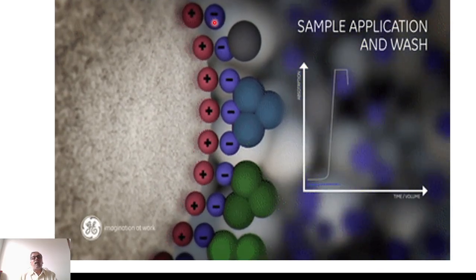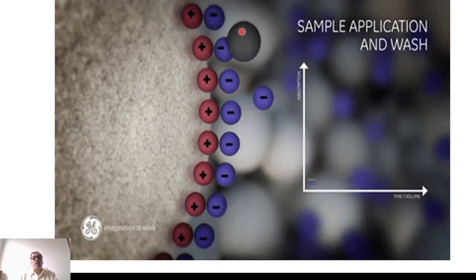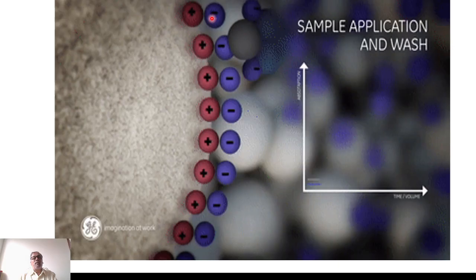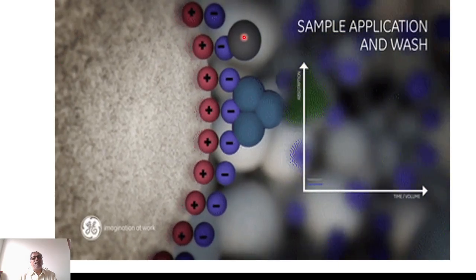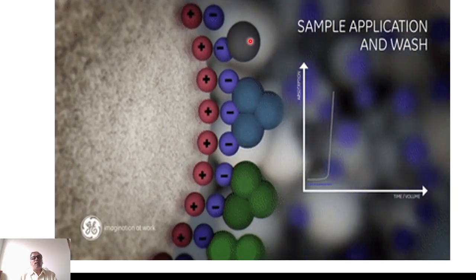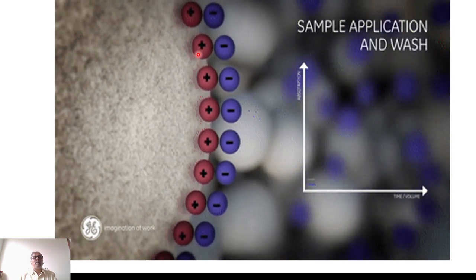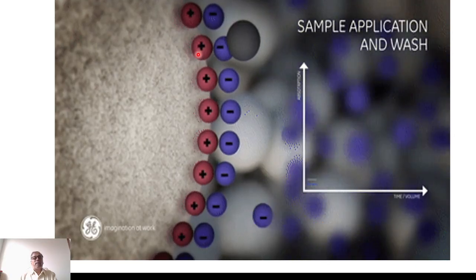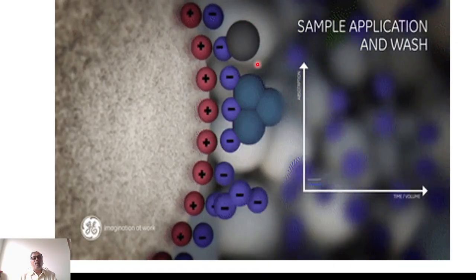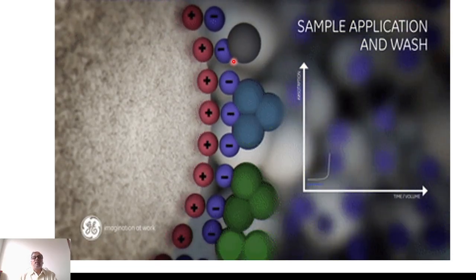Anion exchange resin will have anions as counter ions. So when negative charge sample molecules enter, there will be a competition between the already available negative charge ions and the sample ions. So these negative charge ions will be removed and the sample anions will interact with the resin. In this way you are able to separate or purify. Here the positive charge molecules or neutral molecules cannot interact, they will move as such in the column. Only negative charge ions can be separated.